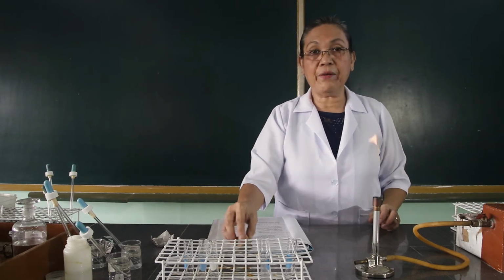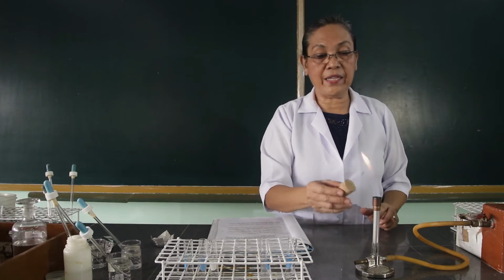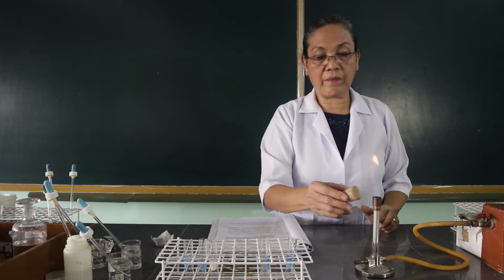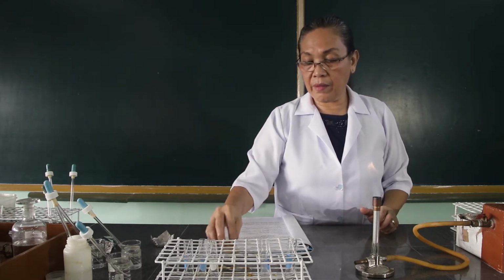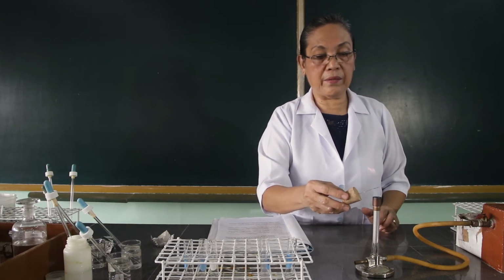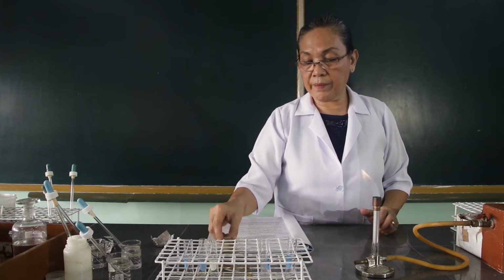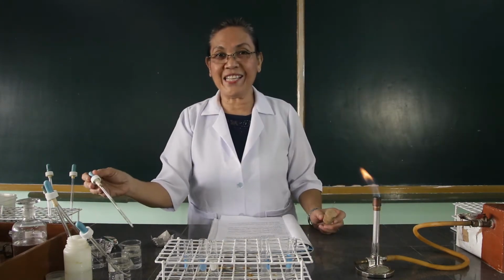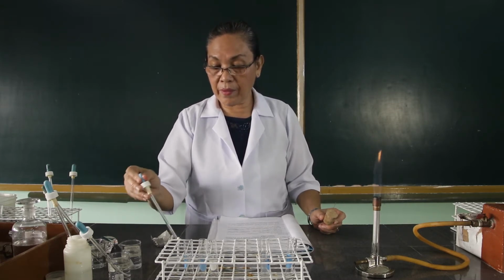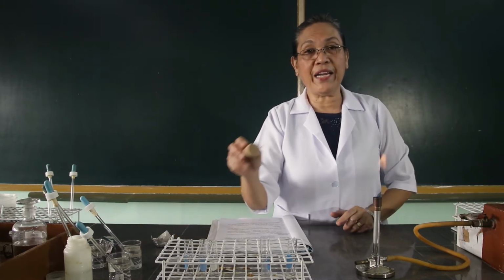So we will clean again our nichrome wire for it to be prepared in analyzing for flame test the barium ion. So let's get some amount of the barium chloride. Kindly observe the color imparted by the barium ion.